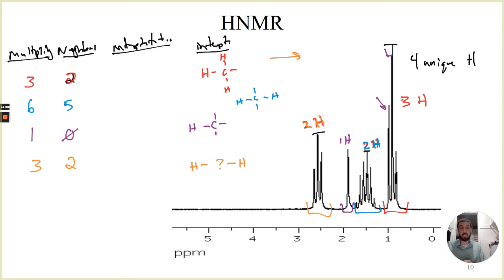And what does this mean? I have neighbors of 2, so for sure the past is true. I still have that interpretation, and I have to have 2 neighbors. Well, here are 2 neighbors. Ta-da! Right? They have to be within the 3 bonds, so cool.